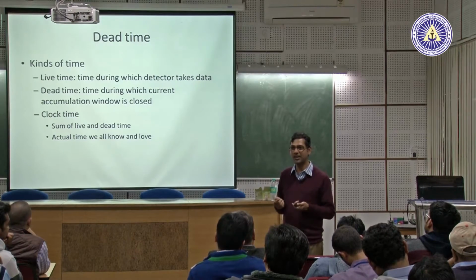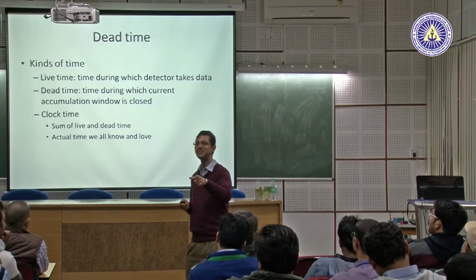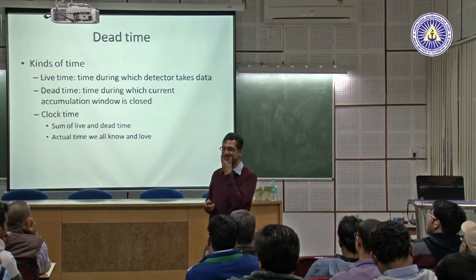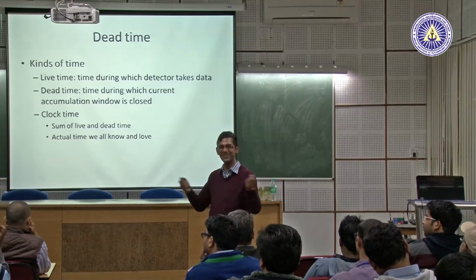Then you can measure the current, and from there you can measure the intensity. Have you not read Khaledi's book, the chapter on detectors? What is the first detector? X-ray detector. Gas filled. Yes. How does it work? Gas gets ionized. Measure the current.